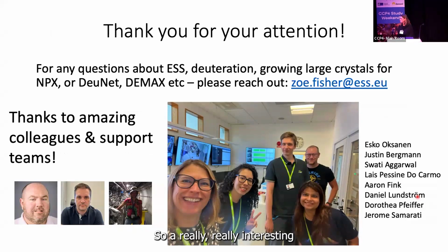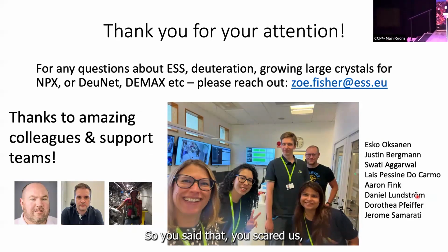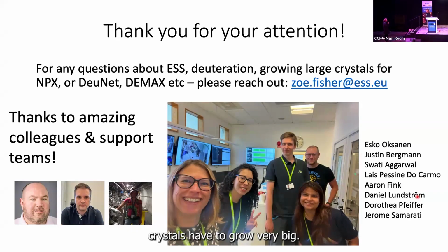Thank you, Zoe. Really, really interesting. I'll start by throwing one or two related questions. So you said that you scared us, saying crystals have to grow very big. This is really hard. You need a lot of X-ray data. But can you comment on the speed that it takes currently at ILL and the speed it will take for a data set at the spallation source, but also comment on the interest of using Laue, that you collect more and less.